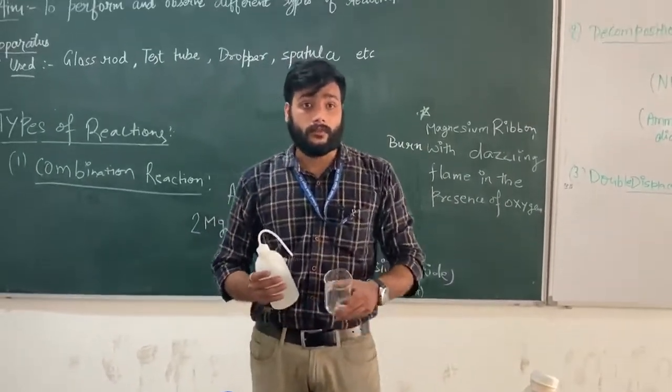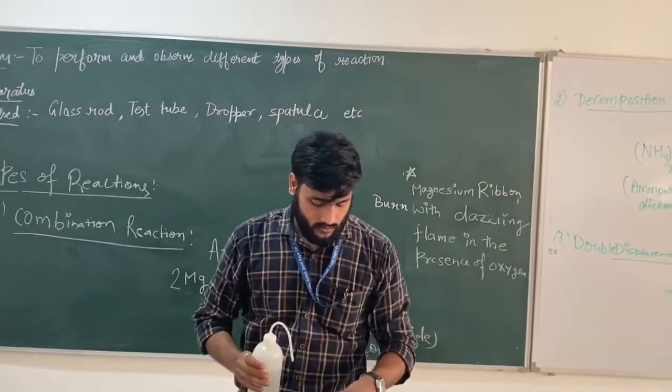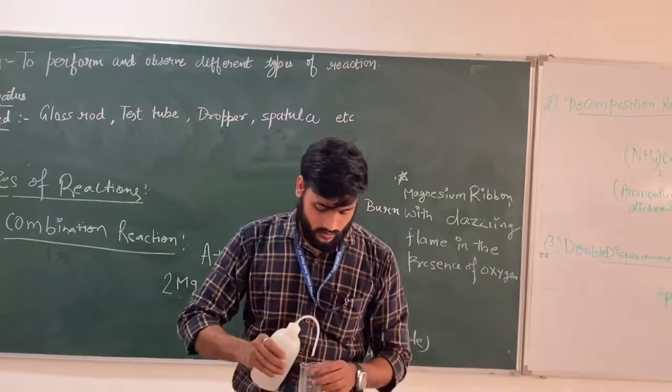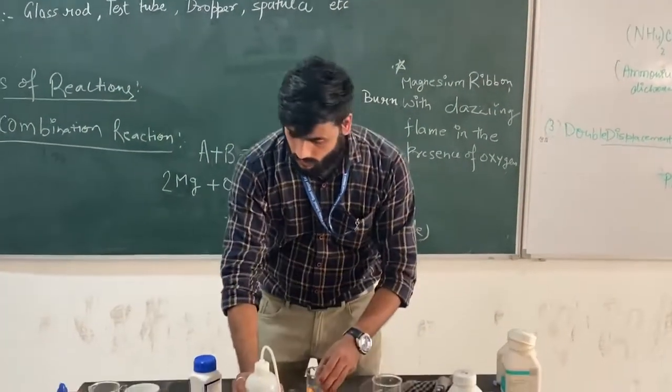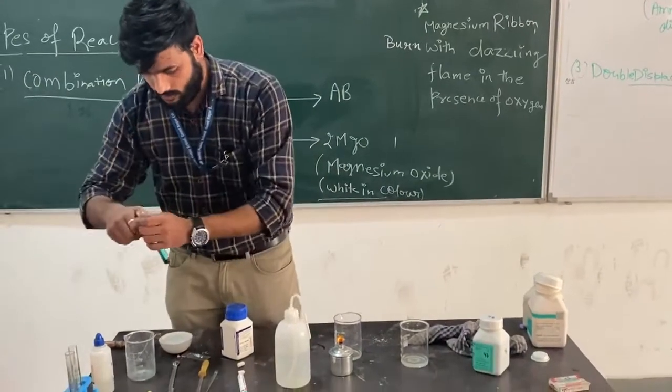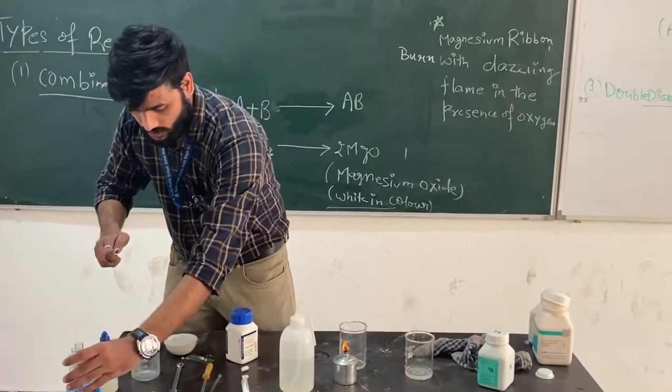Now make a solution of lead nitrate and potassium iodide. Now observe the change, please.